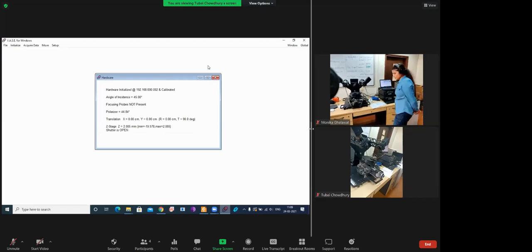So today we'll start with, yesterday we explained that we cannot take our normal plain glass as it is because it is transparent. After that we were explaining the scotch tape. So we'll start today with the scotch tape itself. As you can see in the camera, this is a plain glass and this is a scotch tape.